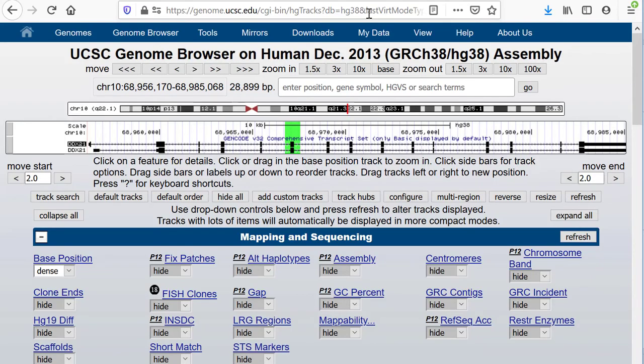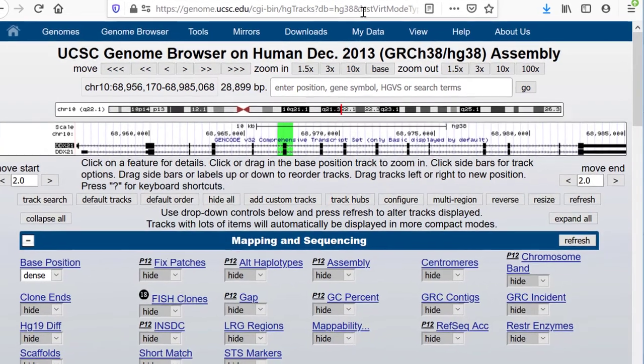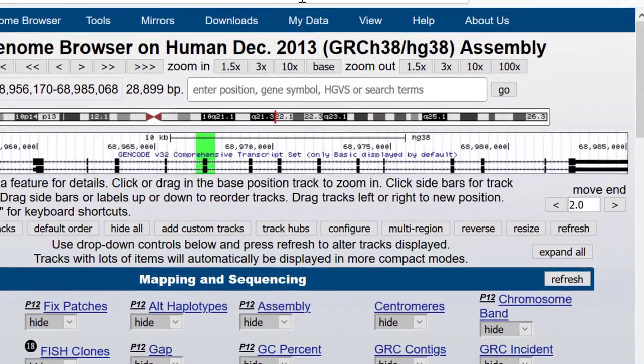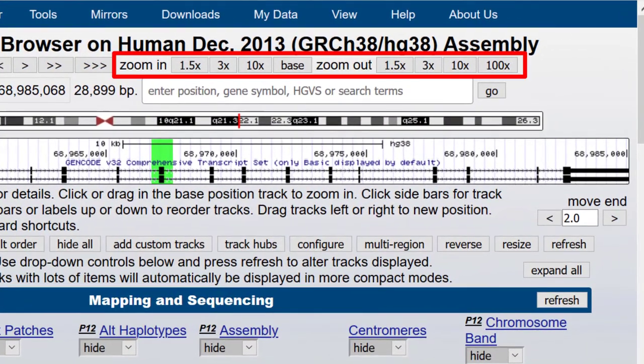There are a number of other options that can be incorporated into links. For example, if you do not like the padding options — such as 5 bases on either side of an HGVS nucleotide or amino acid, and 250 bases on either side of a dbSNP accession demonstrated in the first video — you can encode the action of the buttons above the browser graphic and zoom in or out as indicated. These options are detailed along with several others on the OptParams help page mentioned earlier.